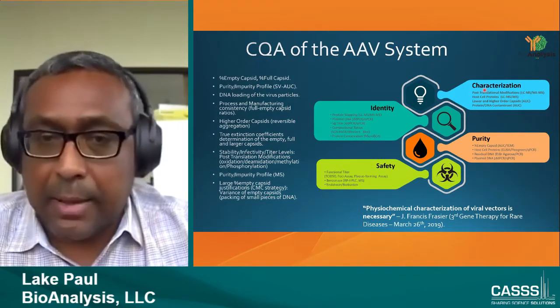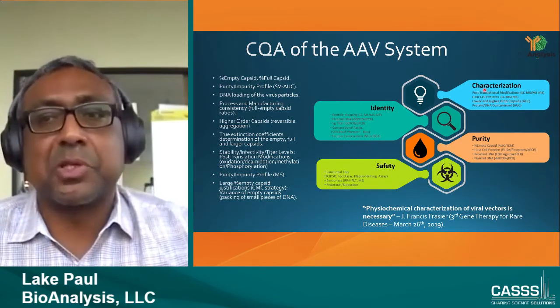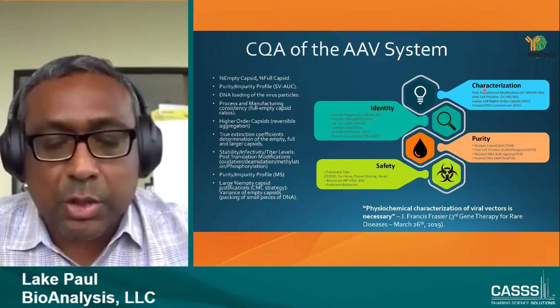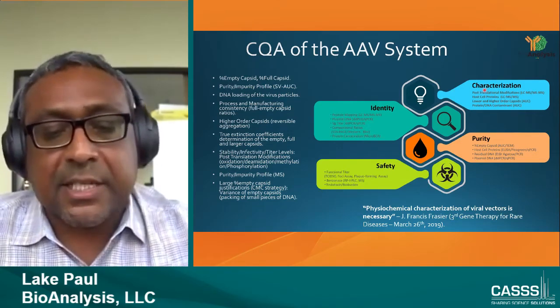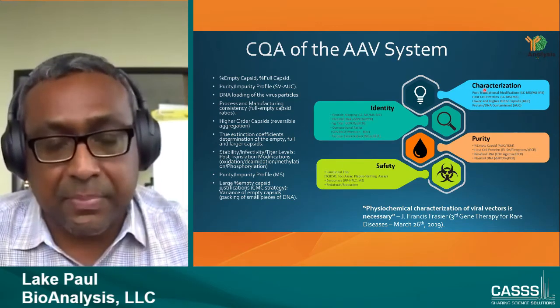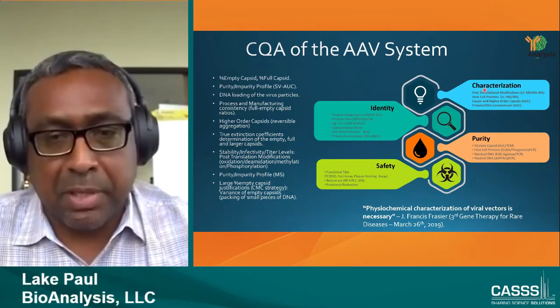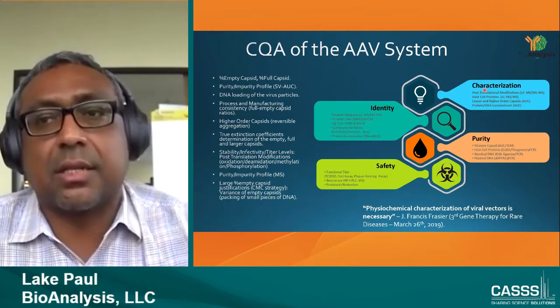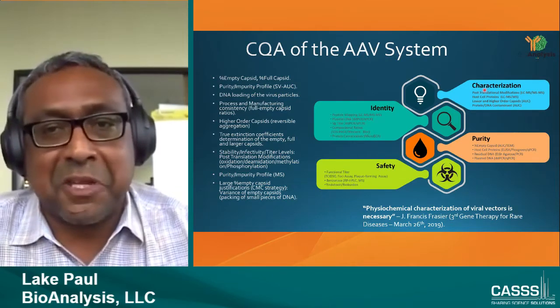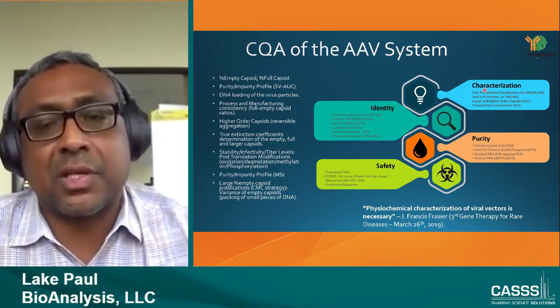So I want to stress that AUC gives you the most complete picture. Another disclaimer is that the only disadvantage of AUC, from my standpoint and from what I've been hearing, is the complexity of the analysis. Well, the complexity of analysis can be easily overcome by education and training, and that for me is not a limitation. You get trained, you can do this.